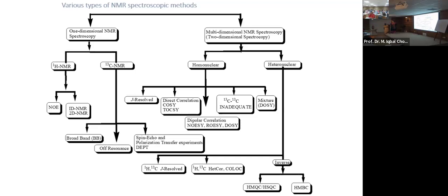If someone is poor, we can borrow the money from someone just to show the bank balance, sometimes to get a visa, and then return it back. So this is the polarization transfer. Just getting polarization transfer to increase the sensitivity.